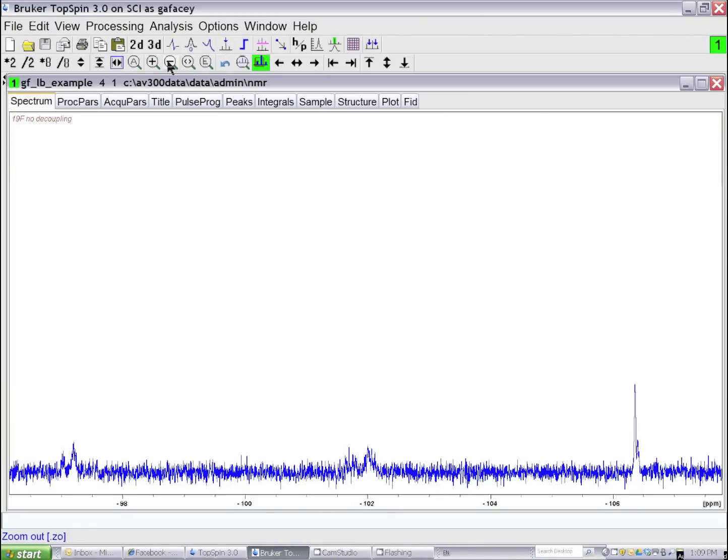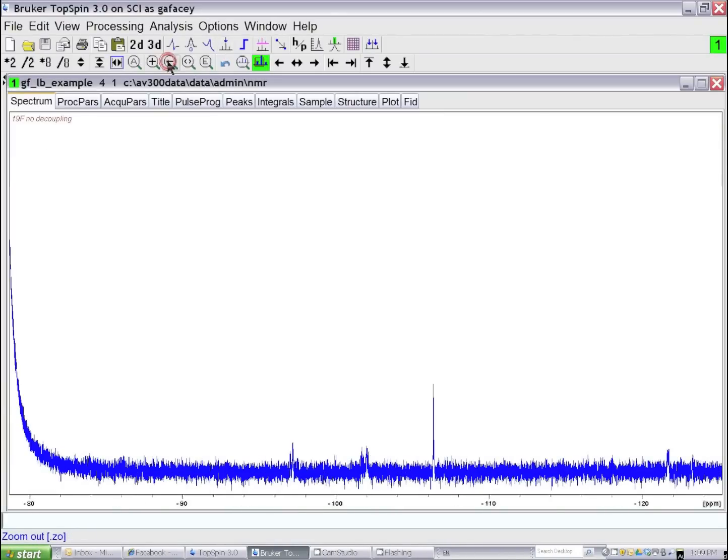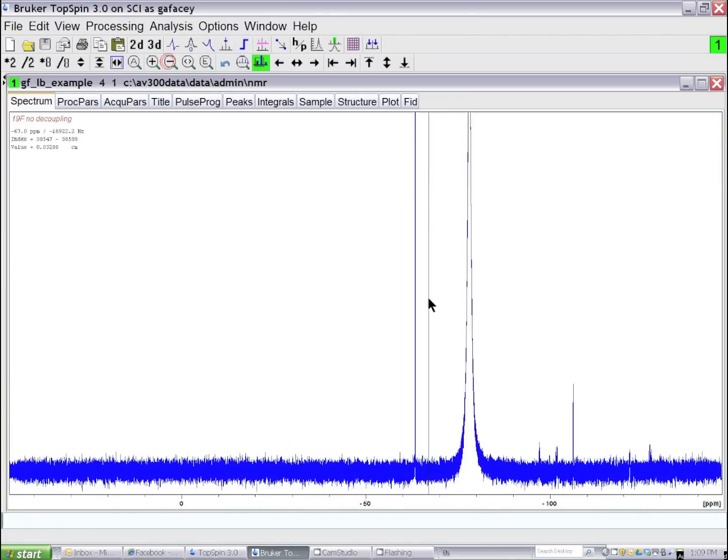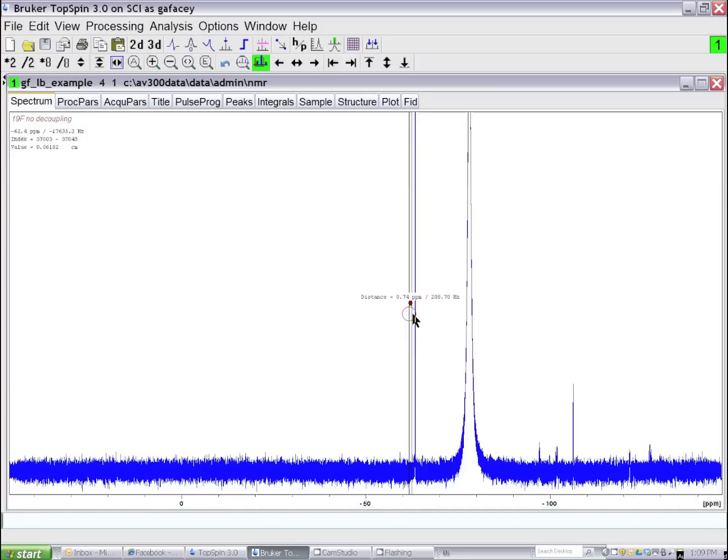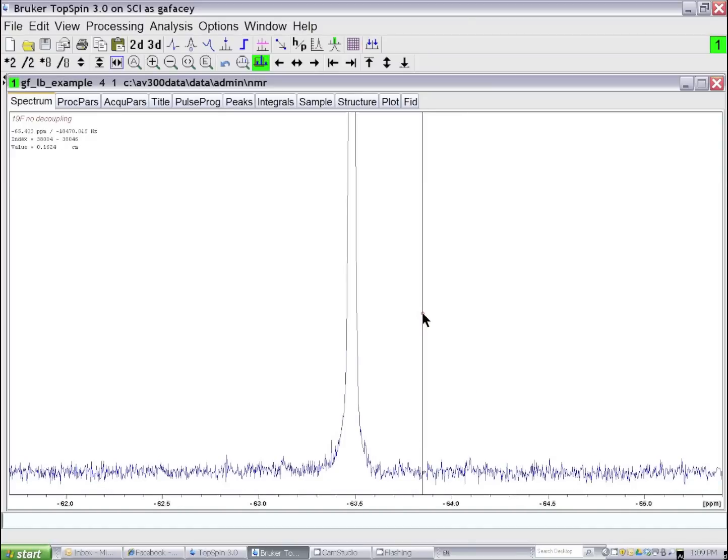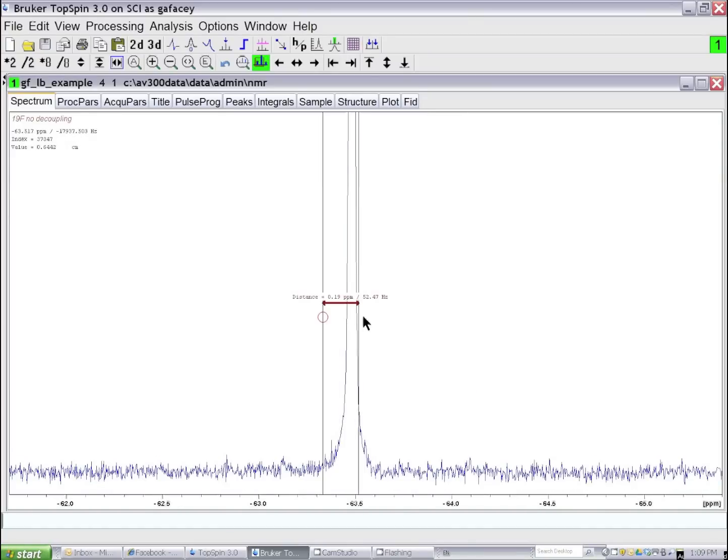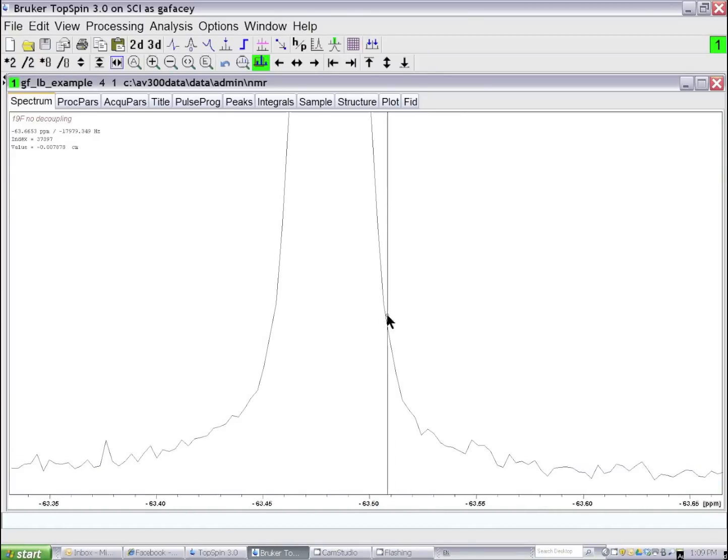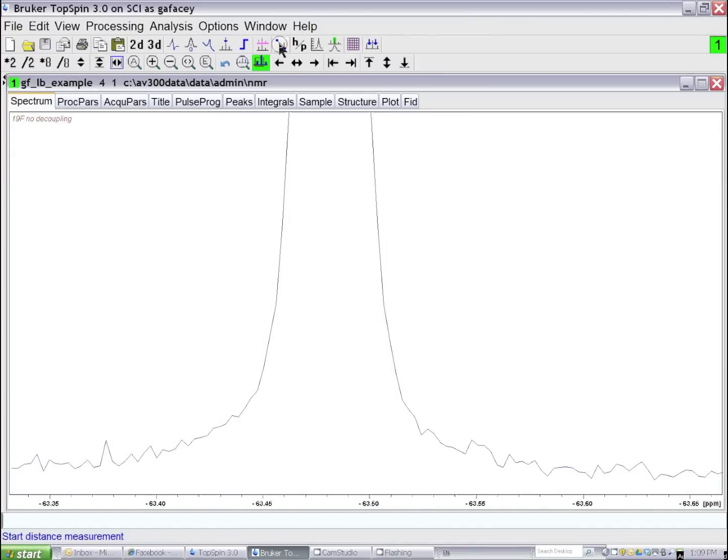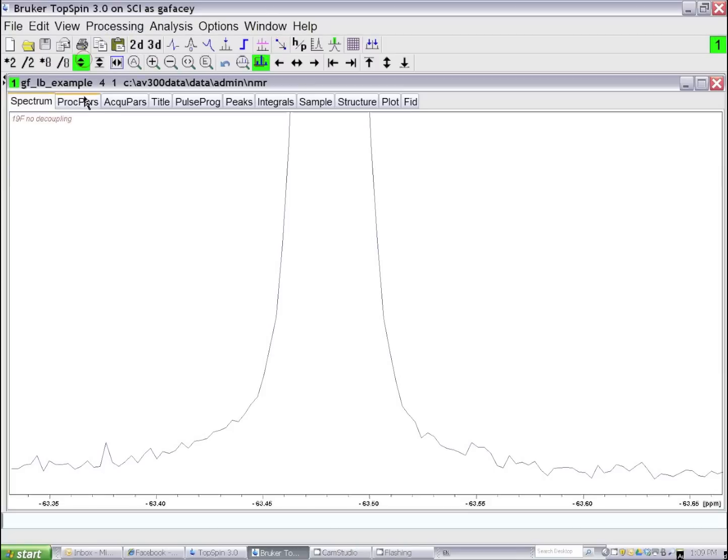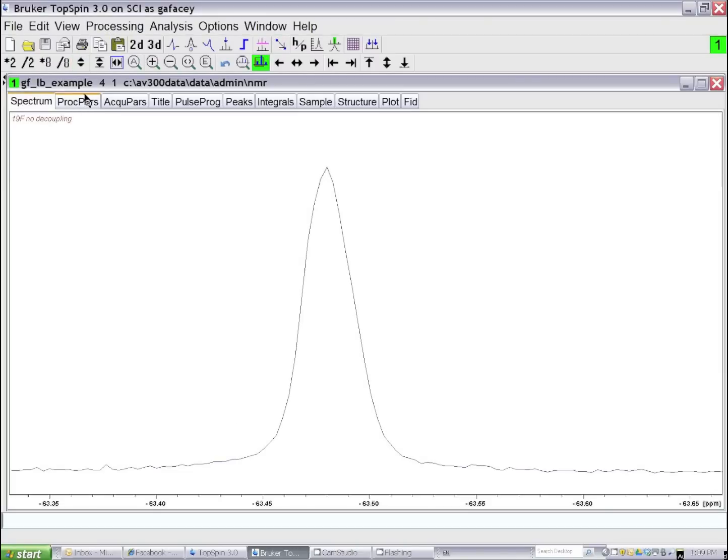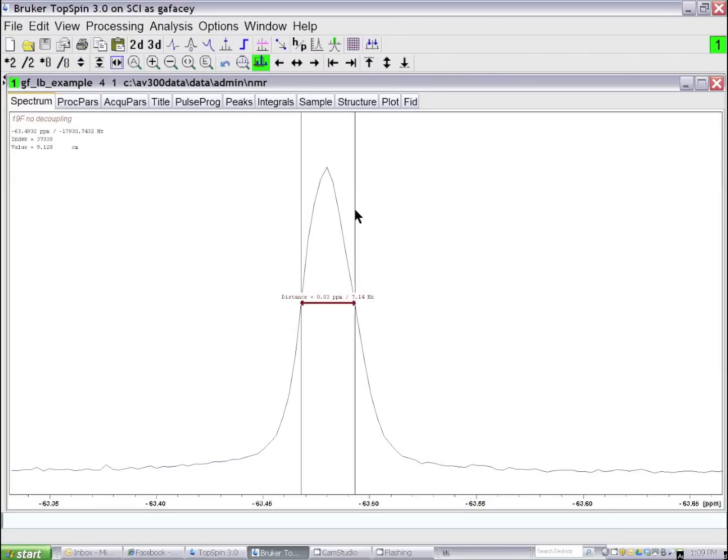We can improve the quality of the data by taking a look at the sharpest line of interest in the NMR spectrum. Let's assume that it's this line, and we measure its width at half height. The width at half height of this line is approximately 7 Hz.